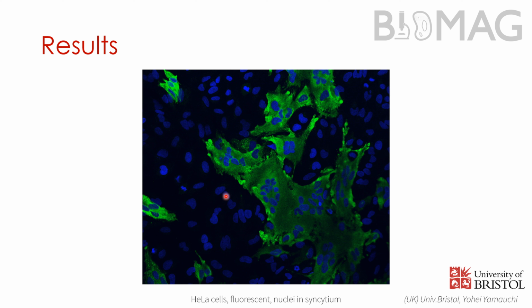And finally, another collaboration with Yohei Yamauchi at the University of Bristol in a coronavirus project, where we wanted to identify the nuclei in the syncytium areas, which are these large fused cells here.